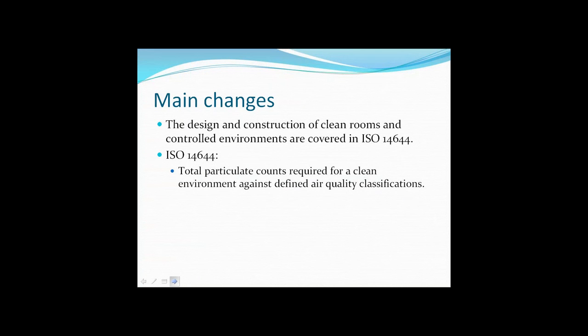So in continuing to look at the main changes, as I've said, the chapter refers to the International Cleanroom Standard ISO 14644 quite a lot. So for the design, building, classification, verification and operation of cleanrooms, ISO 14644 is to be followed, particularly in relation to airborne particle cleanliness. And just as a reminder, hopefully not over-egging it, EU GMP only uses ISO 14644 for classification, but not for operation.